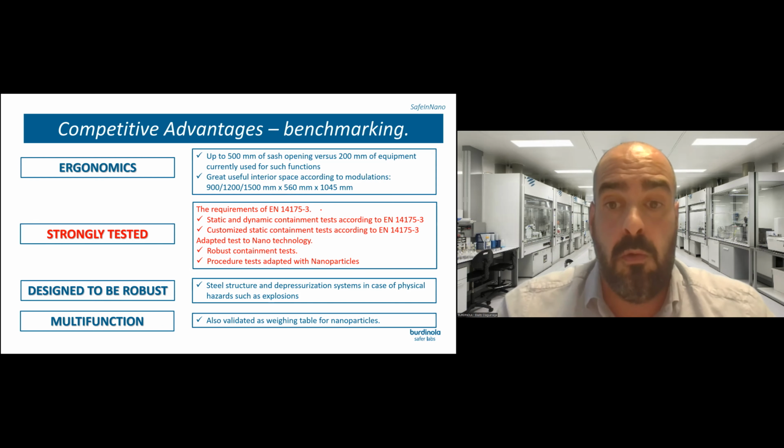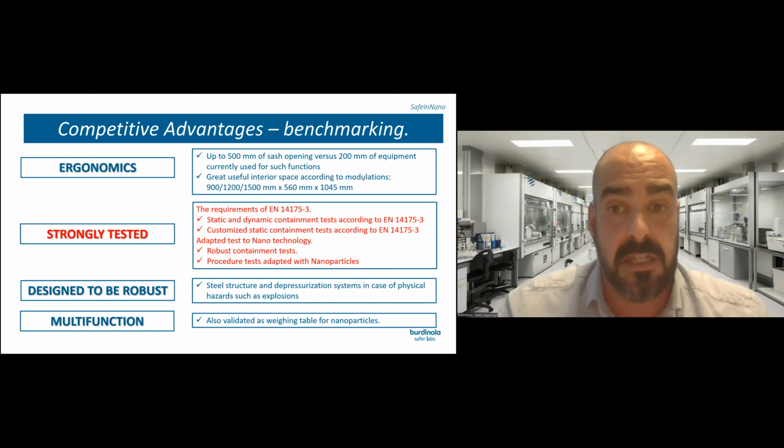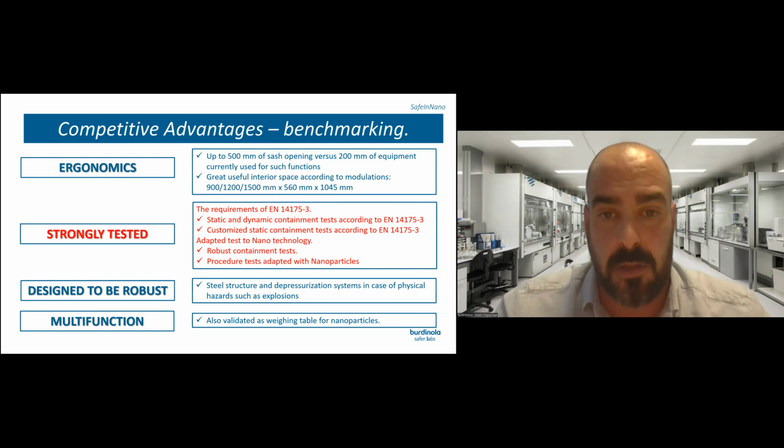What we have done is replace the SF6 tracer gas used in EN 14175 with NaCl nanoparticles.